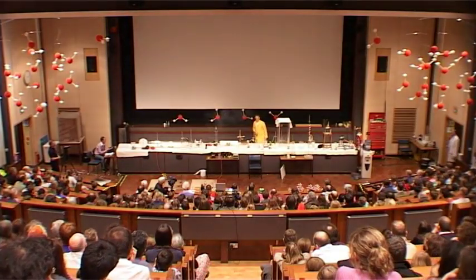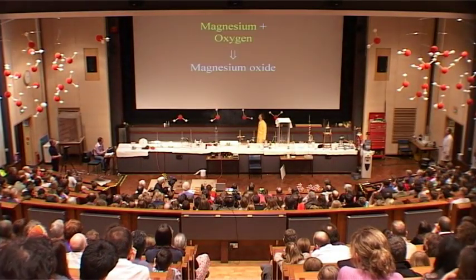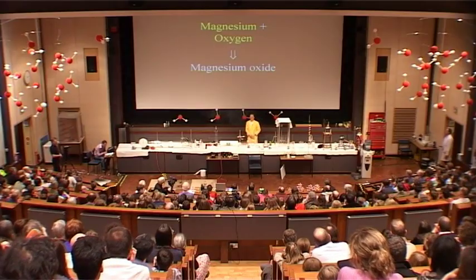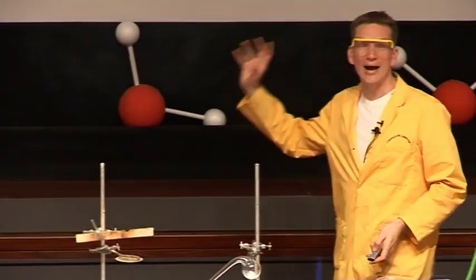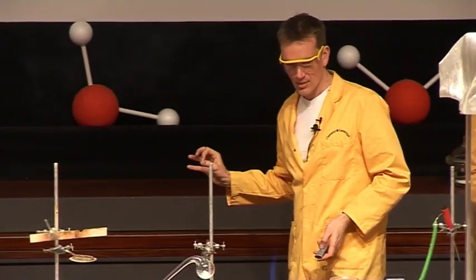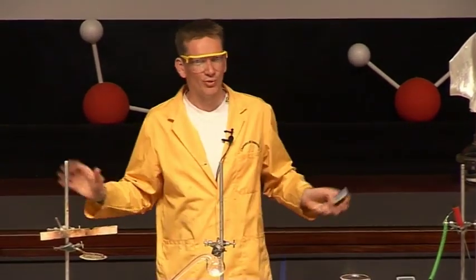Well, we can show this with a slide for the reaction. So we have magnesium reacting with the oxygen from the air, forming the smoke that we see here, magnesium oxide. Okay, well, that didn't involve any water whatsoever.